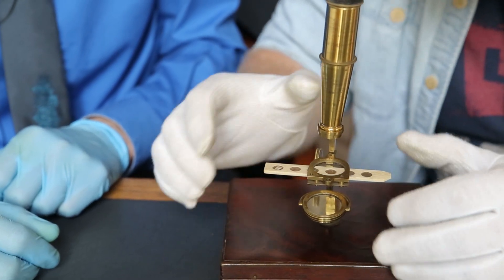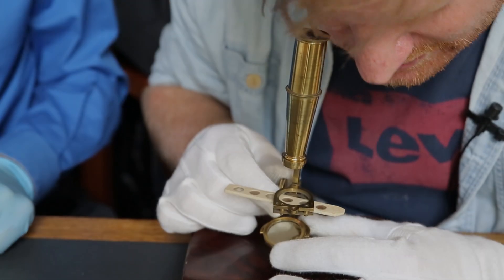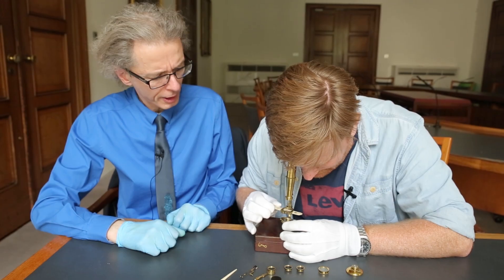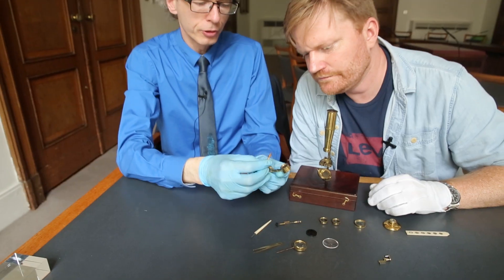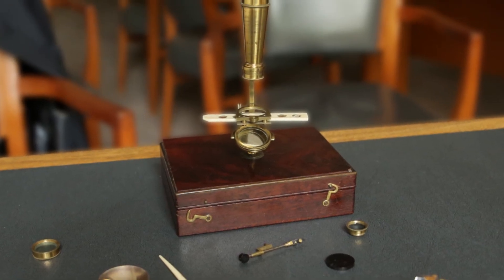Shall we put something in it? Yeah, let's do that. And if you look through the top and make the right adjustment with the mirror — it's quite fiddly. I can see it! I can see it moving around. It does seem fiddly if it was a windy day out on an English mountain or something like that. It's fiddly, but at the same time it's getting used to using it, and you would pretty quickly be able to do that. Scientists like Anthony van Leeuwenhoek used single lens instruments, and this is a single lens microscope. So these rather interesting pins here are to mount your specimen. You have a single lens and a pin where you can put your specimen — I'd put a little bug on there. Exactly right. Simple as that.